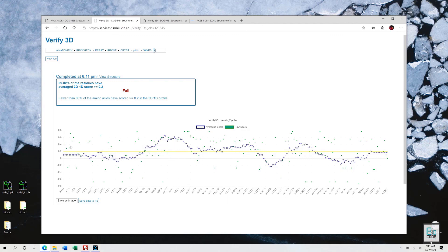But our protein, our model, has so many outliers in the structure that the values in the condition are below the mean.